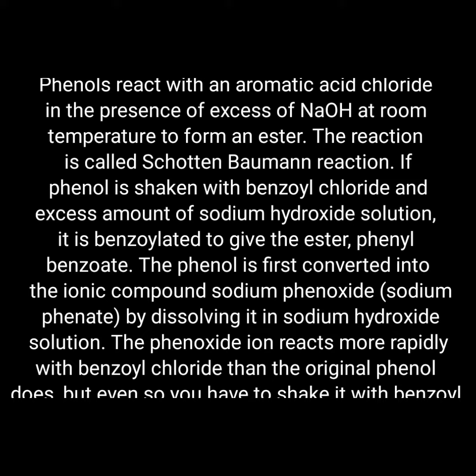The theory of this includes that phenol reacts with an aromatic acid chloride in the presence of excess NaOH at room temperature to form an ester. The reaction is called the Schotten-Baumann reaction.